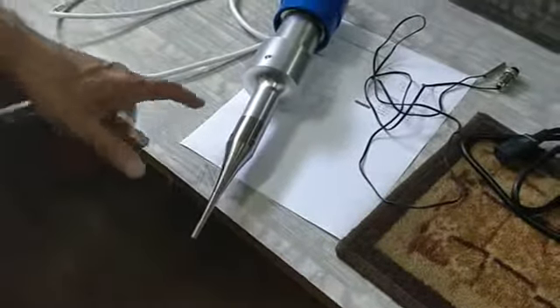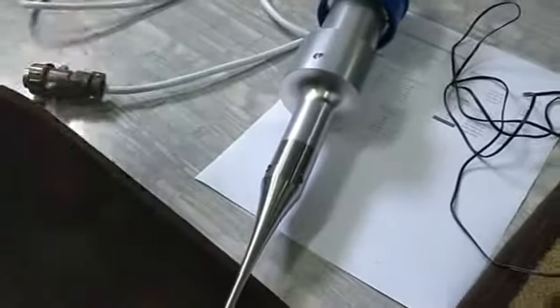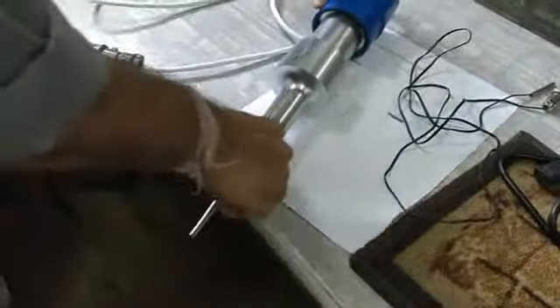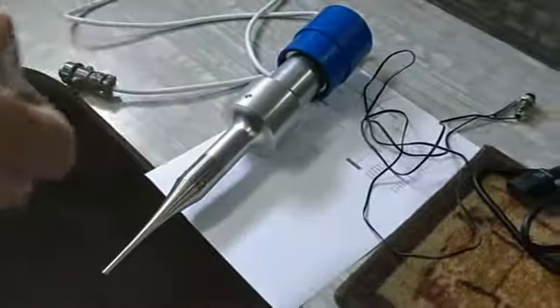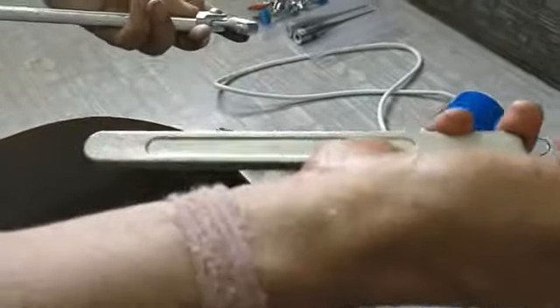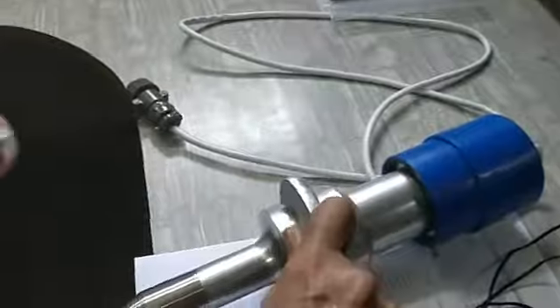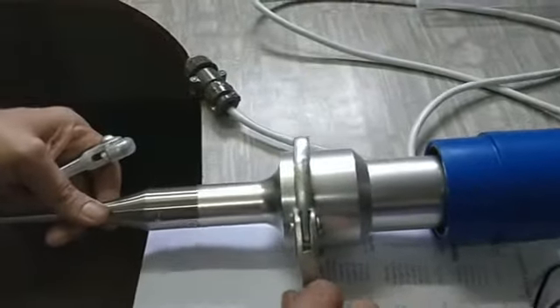Now what we will do is this is a 6mm dia probe, and we will change it to 2mm dia probe. This is not very complicated. There are two special tools. You can see this is a bigger tool and this is a smaller tool. We will have to fix the bigger tool like this.